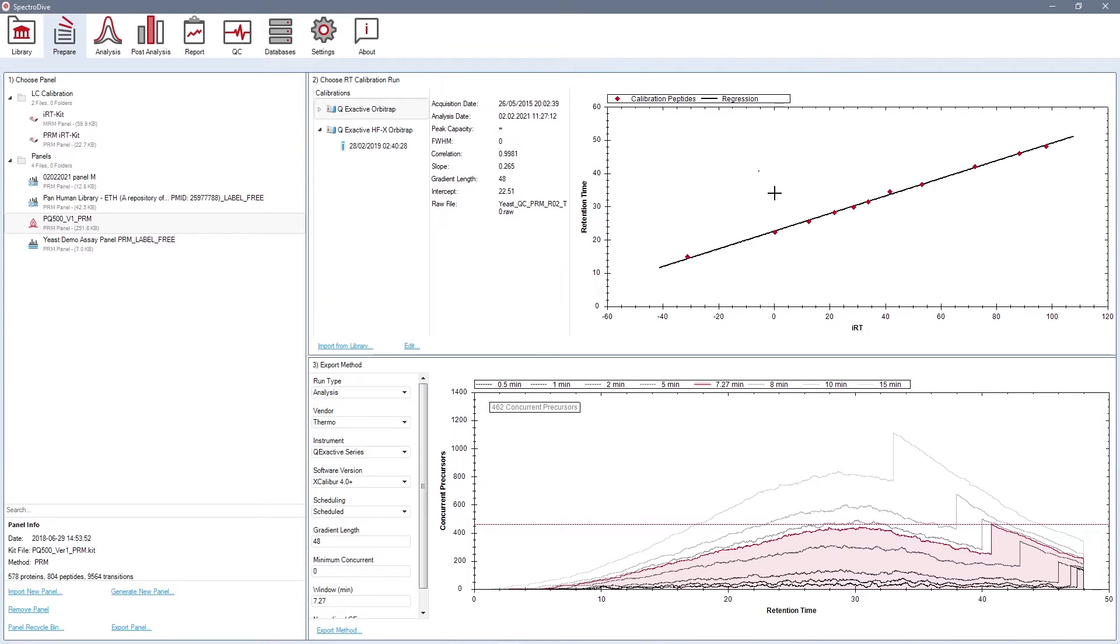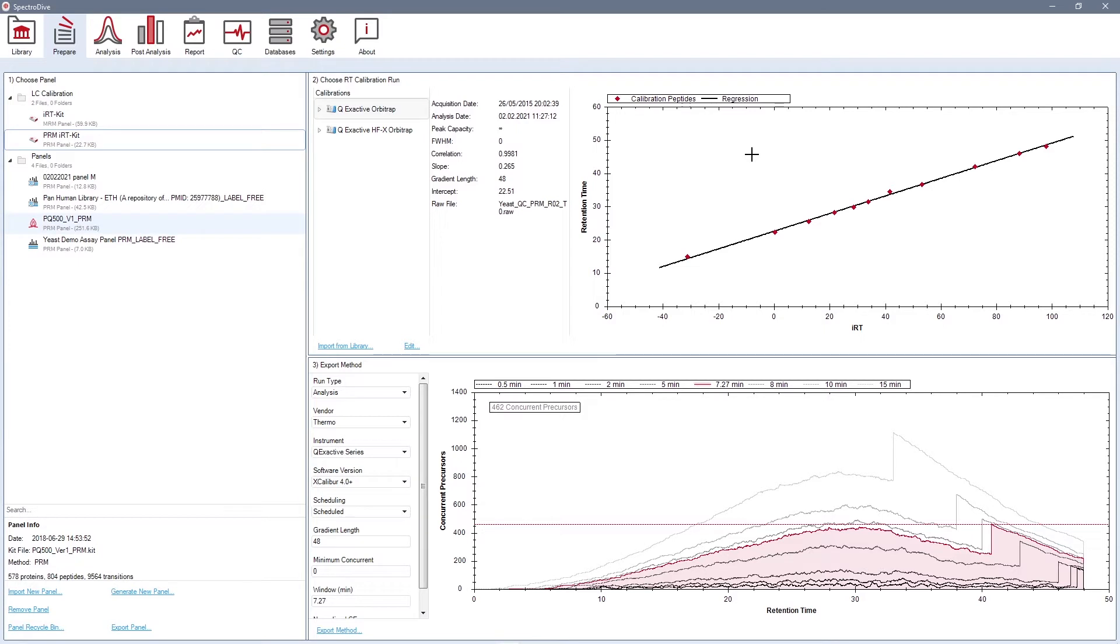In the next step, you will generate an analysis method to set up an acquisition method on the MS instrument. First, you need to select your panel. Then you need to choose a calibration run to set up a scheduled acquisition of the targets.